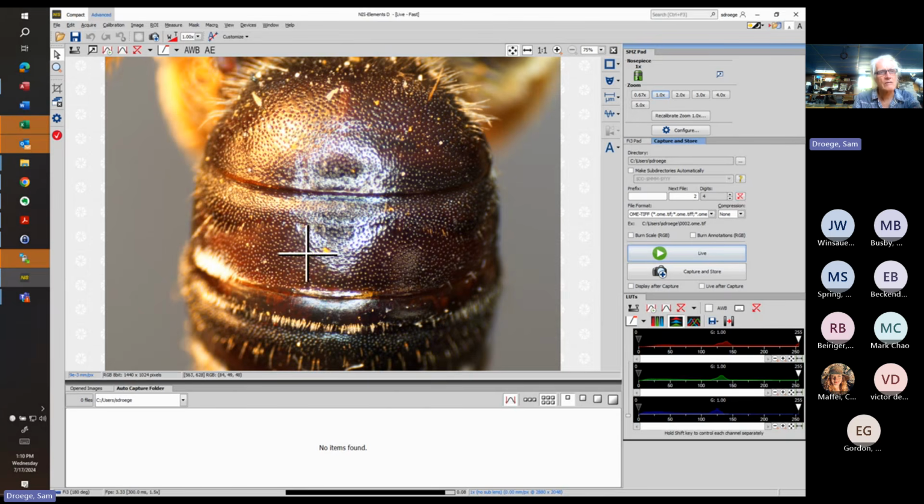So these are subtle, and so it often doesn't show really well in a photograph or, like we are looking at now, a video grab. But if you look here, you can see that something's going on right about there. And indeed, it's the change from this area being depressed to this being elevated.